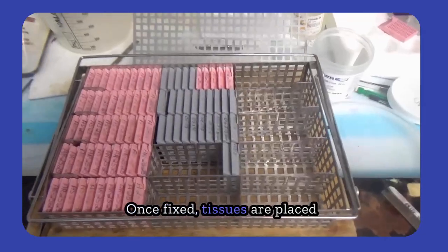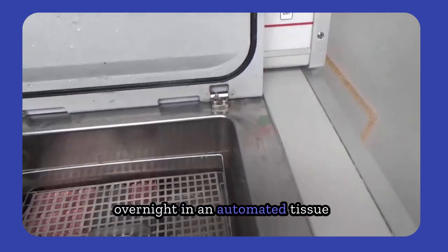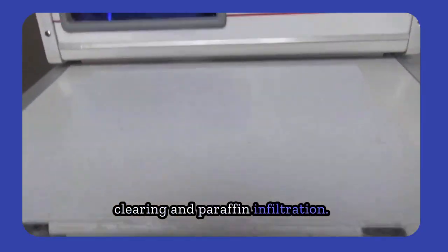Once fixed, tissues are placed into labeled cassettes and processed overnight in an automated tissue processor, which performs dehydration, clearing, and paraffin infiltration.